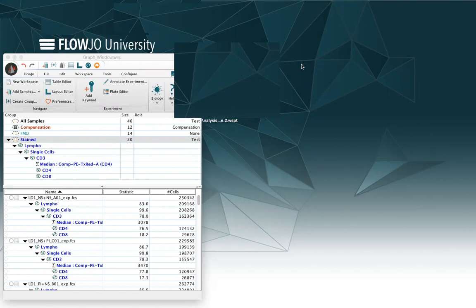In this case, for example, I've created my gating strategy, and I want to save it as a template to use it later on with a different set of data.